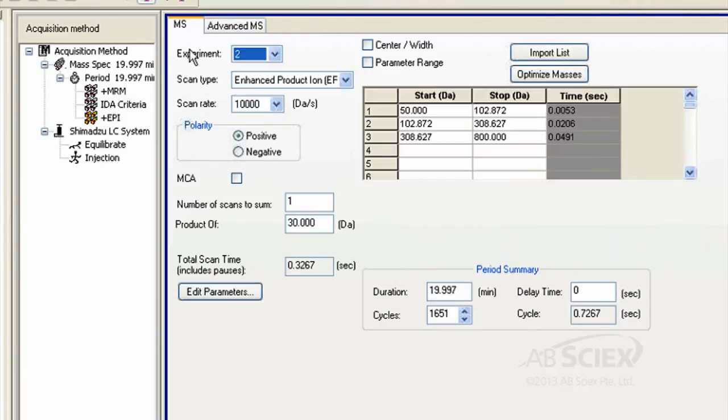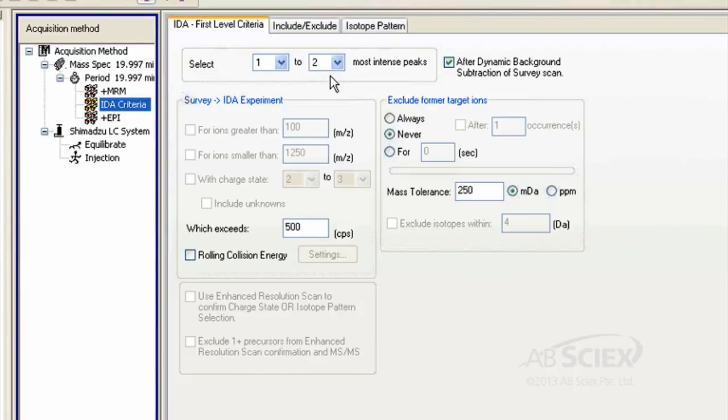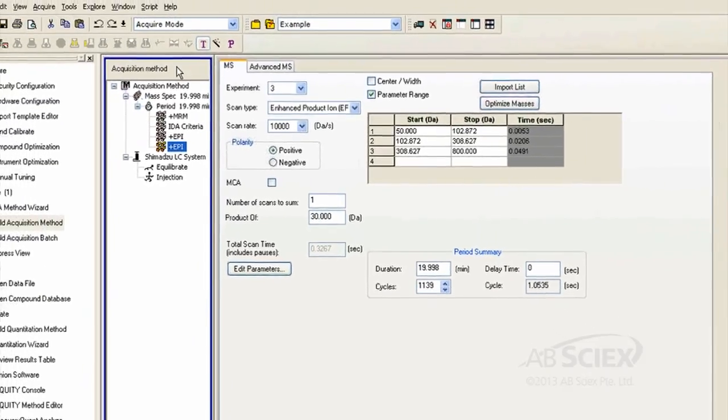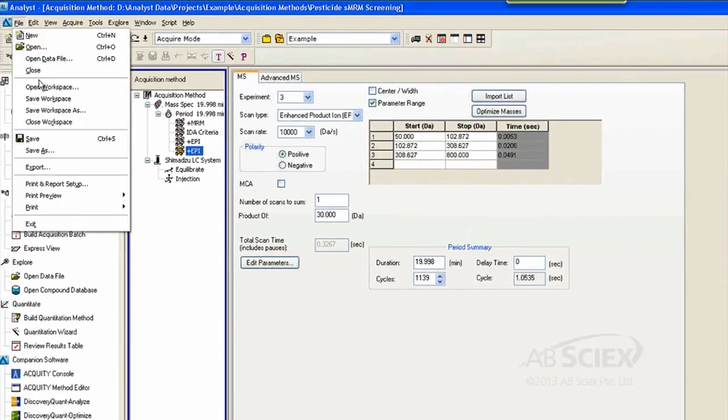Since we set up our IDA to monitor the two most intense peaks per cycle, we will need to duplicate the EPI experiment to cover both. To do this, right-click on your EPI experiment and select Copy this experiment. Finally, save your method and you're ready to go. It's that simple.